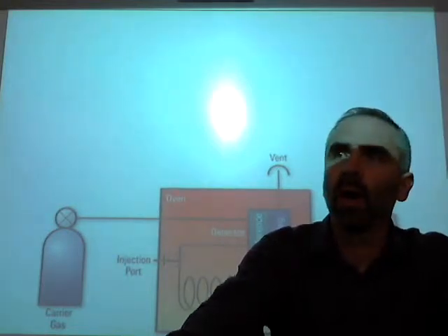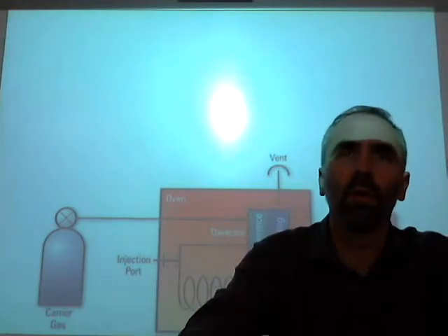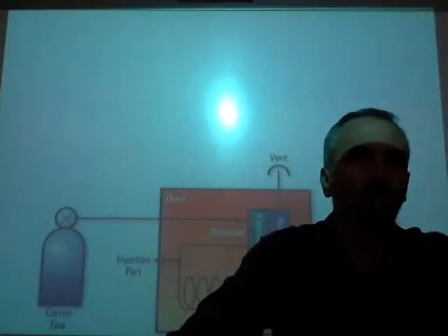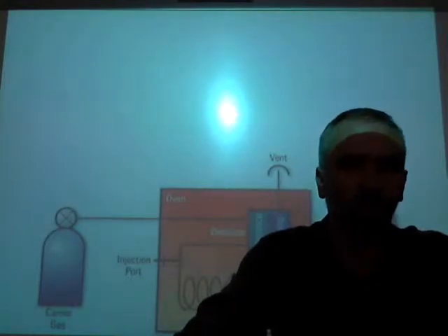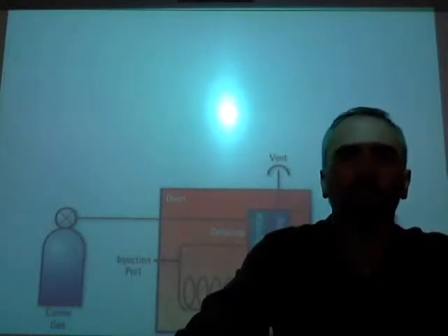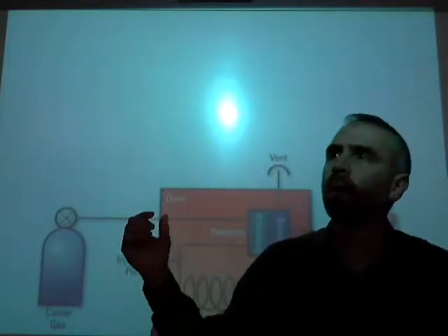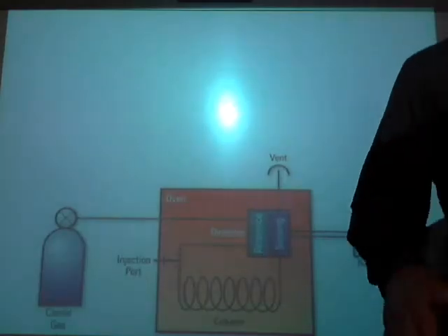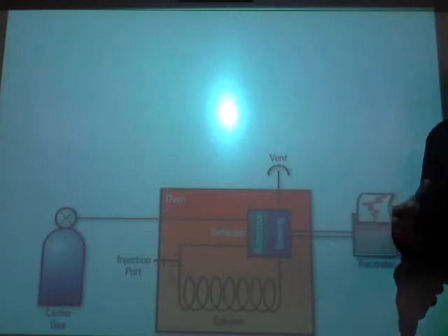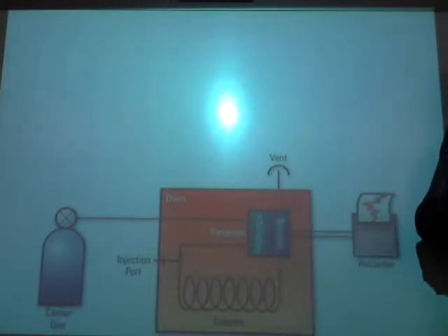If I have to run 20 samples, and it takes minutes for each one to run through, I can load the samples up, like I said. But one of the things I've always been very hard on you about is taking your observations down, writing stuff down, being organized, and reading and following instructions. If I'm doing a set of samples like that, and I don't label every one of them perfectly, and it's going to run overnight, and I'm going to come in the next morning and read these, if I didn't label them, if I'm not organized, that's like the biggest thing.